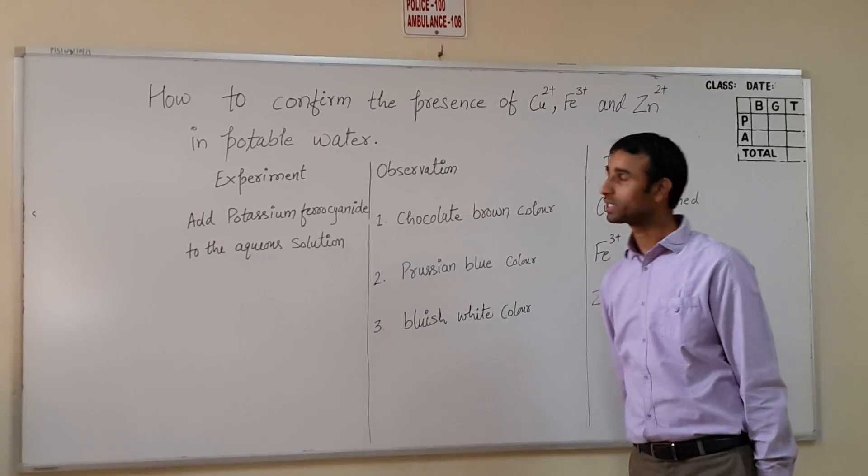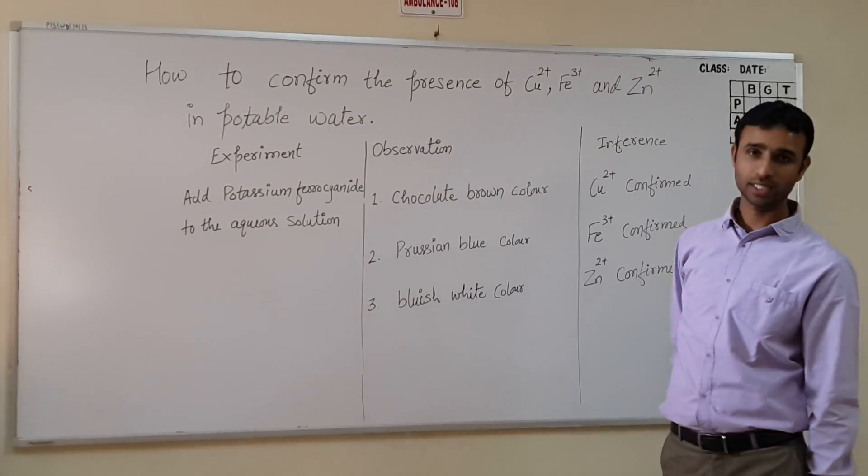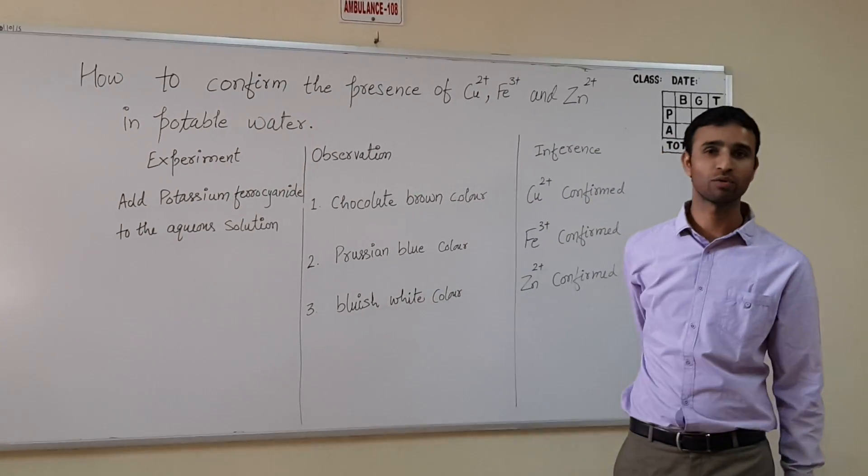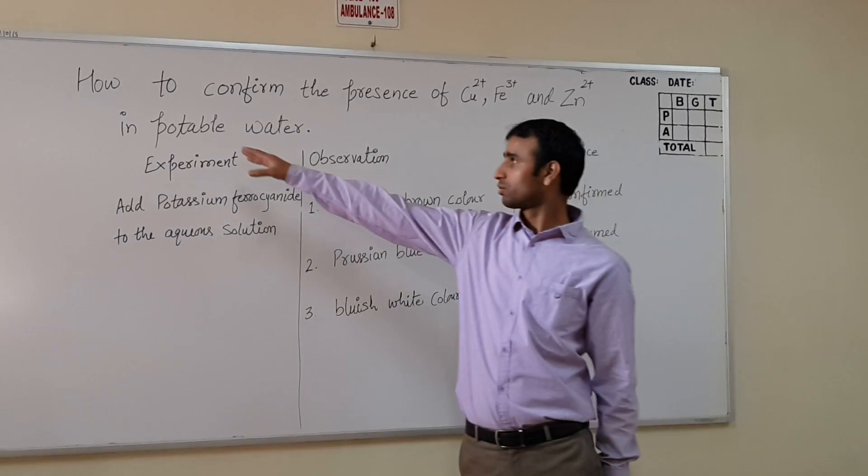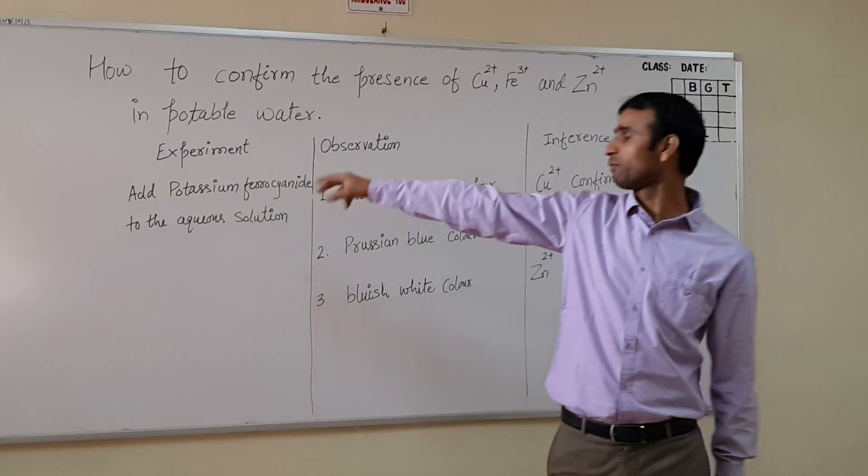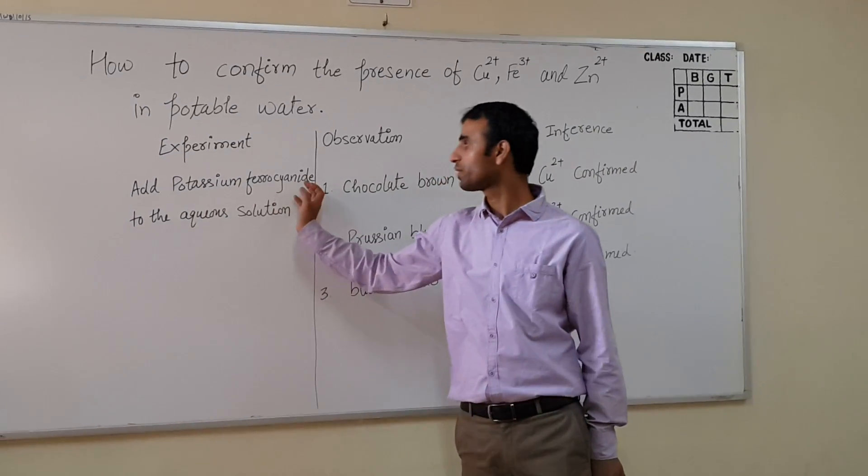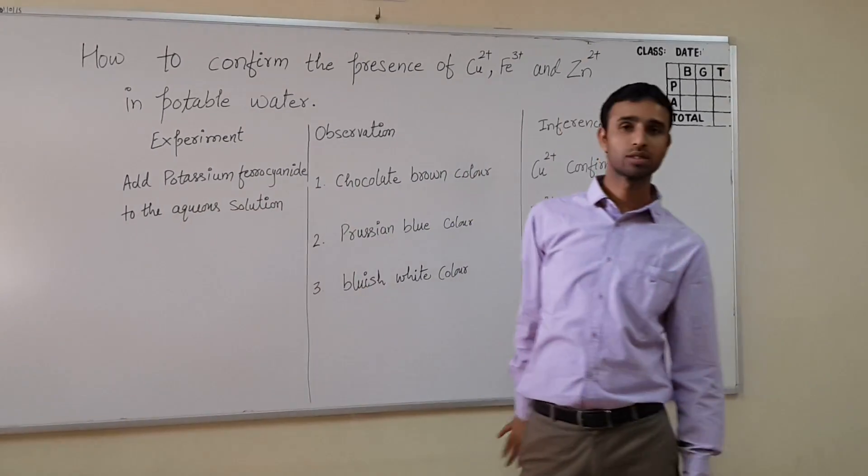How to confirm the presence of Cu2+, Fe3+, and Zn2+ ions in potable water. To do it, we do potassium ferrocyanide test. For that, we add potassium ferrocyanide to the aqueous solution.